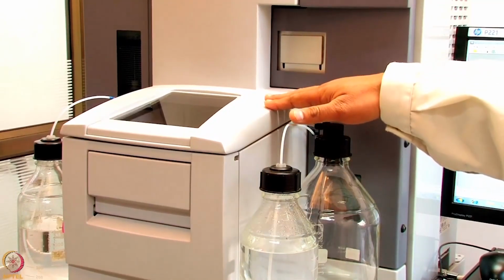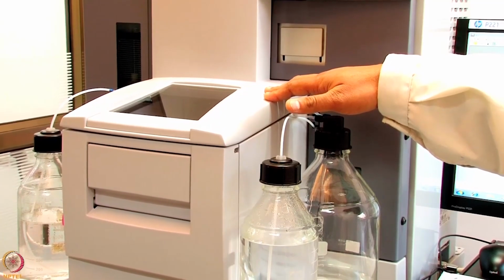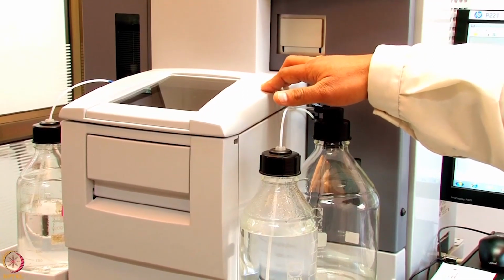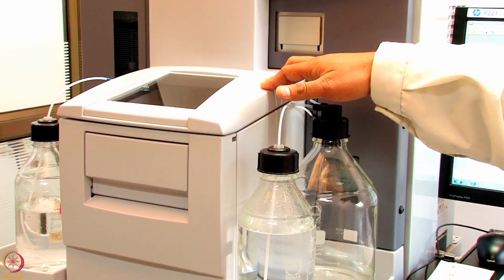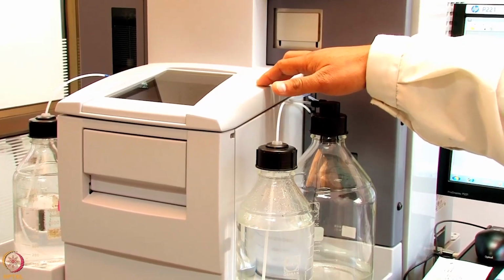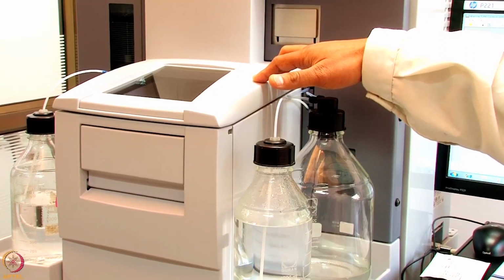Generally, in any biochemical experiments, buffer should be connected and equilibrated overnight, or if there is no time, a minimum of 3 hours of equilibration is essential. Otherwise, when starting a new experiment, do at least 6 primes on the system.